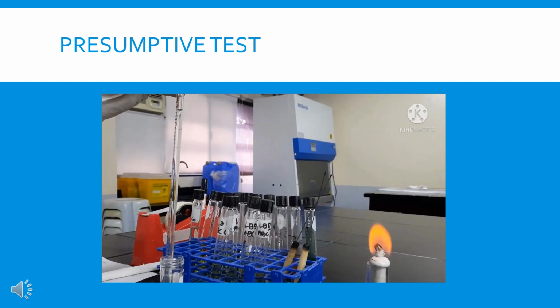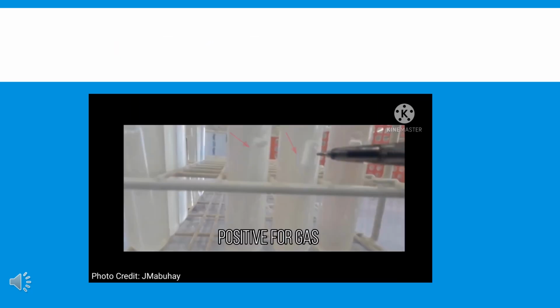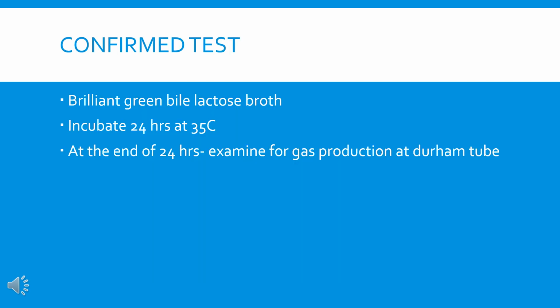We use a pipette to collect 5 ml of your sample and then put it on your lactose broth. So this is an example of your lactose broth, and you have to make sure that each tube is labeled. In here you can see that after 24 hours, there are bubbles formed in your Durham tube, so this means that it is positive for gas. So again, if it's negative, you have to re-incubate it for 24 hours and then check again. Now we're done with your presumptive test.